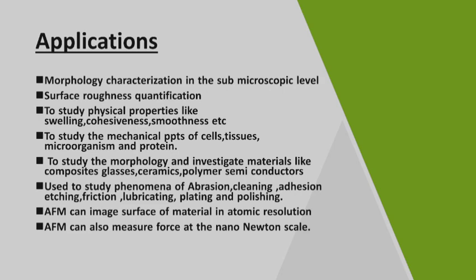It is also used to study abrasion, cleaning, adhesion, etching, lubricating, plating, polishing. AFM can image the surface of a material in atomic resolution, and it can also measure force at the nanonewton scale. That is a very small range.